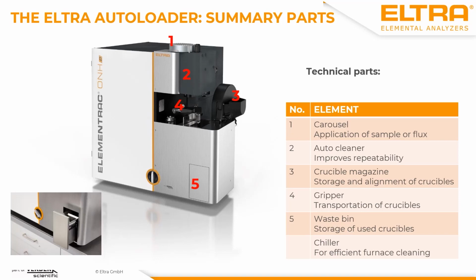Then we have the crucible magazine, where you just put in your crucibles. It's here located in position number 3. Position number 4 here shows the gripper, which took a new and an old crucible and replaced it on the lower electrode. The thing which was not shown in so much extent is the waste bin of this autoloader.